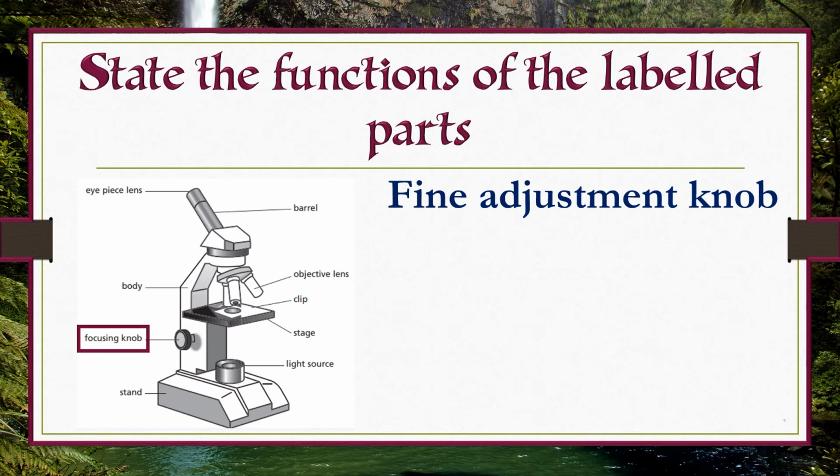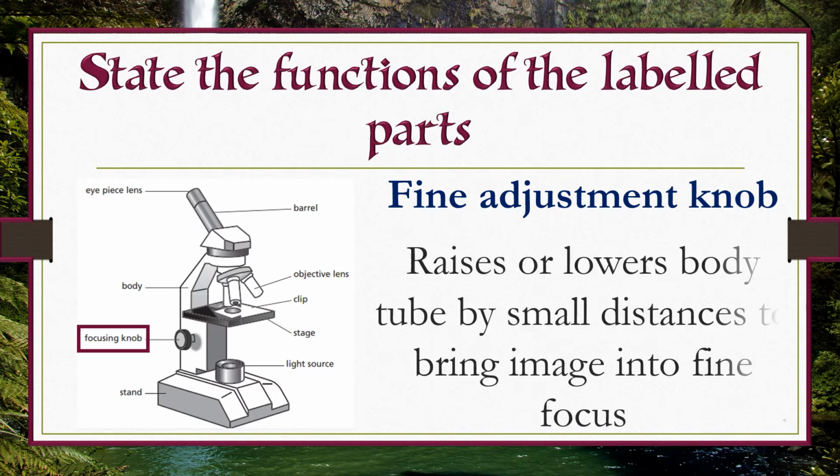The fine adjustment knob raises or lowers the body tube by small distances to bring the image into fine focus.